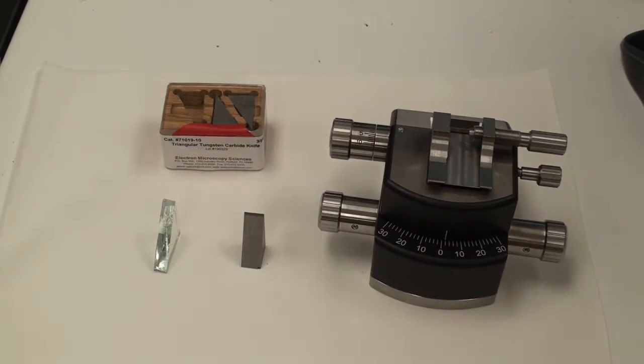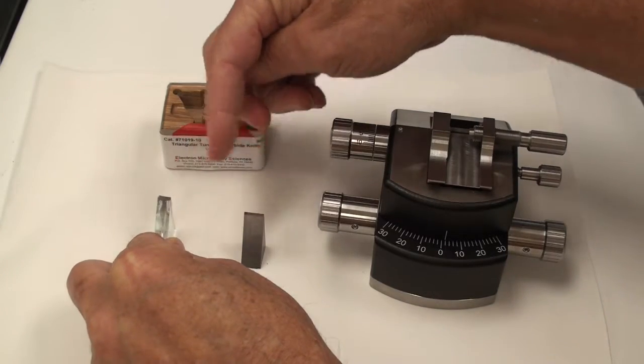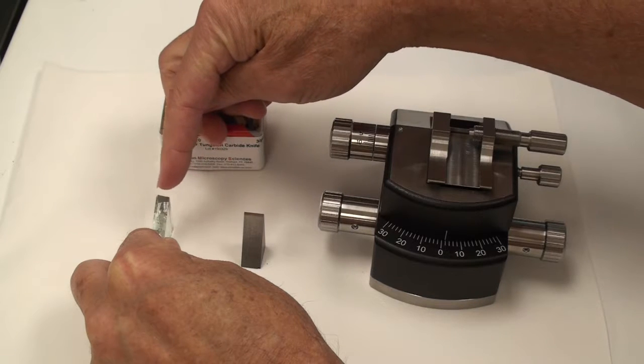So to prevent these mistakes, I use sharp razor blades and rotate it 90 degrees so I can see the side. I'm pretty well done with my rough trimming, and now it's time to face off. Typically we have either a glass knife or a diamond or a tungsten carbide knife.